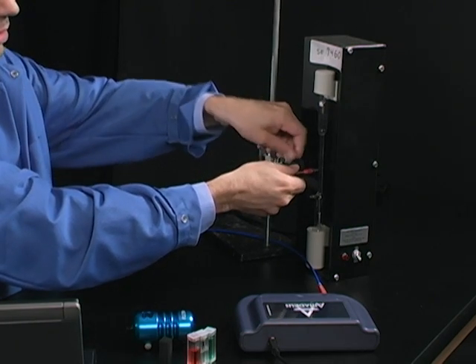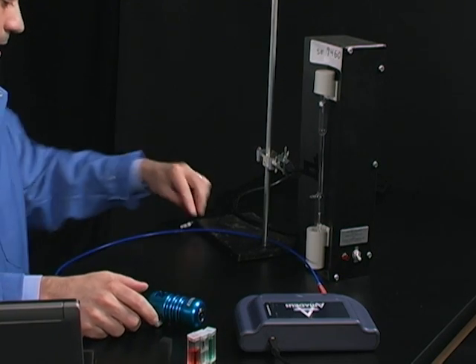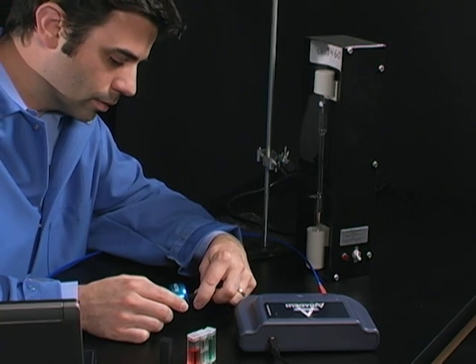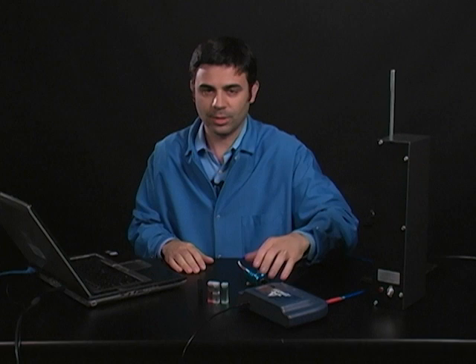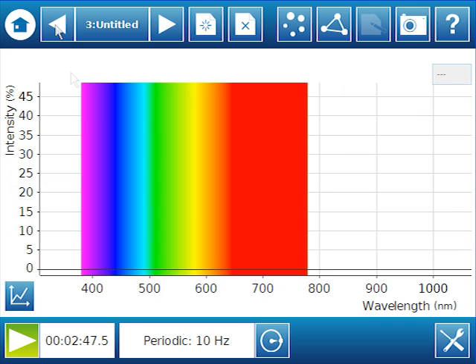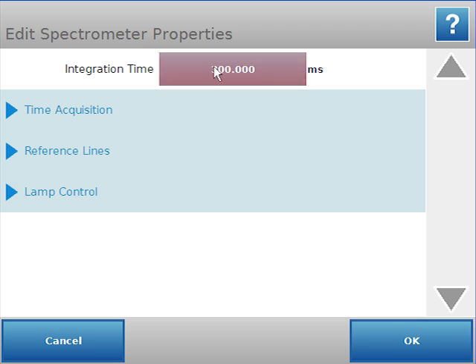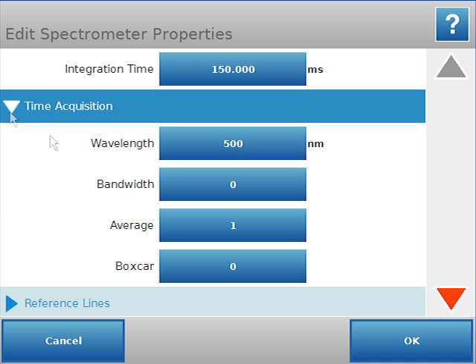And now we need to reconfigure the Amadeus a little bit so that it can hold the samples. So now we're going to shine a light through samples instead of looking at a sample of colored light. So I'm going to attach my fiber-optic cable here. And this is a little light source that can be plugged in. And now there is a light in there that will shine through the sample. And we'll be able to do some spectroscopic measurements. So I'm going to, again, we have to do a little bit of configuring to tell it what to do. I'm going to configure my sensors. And this time, edit my spectrometer. I'm going to change this to 150.